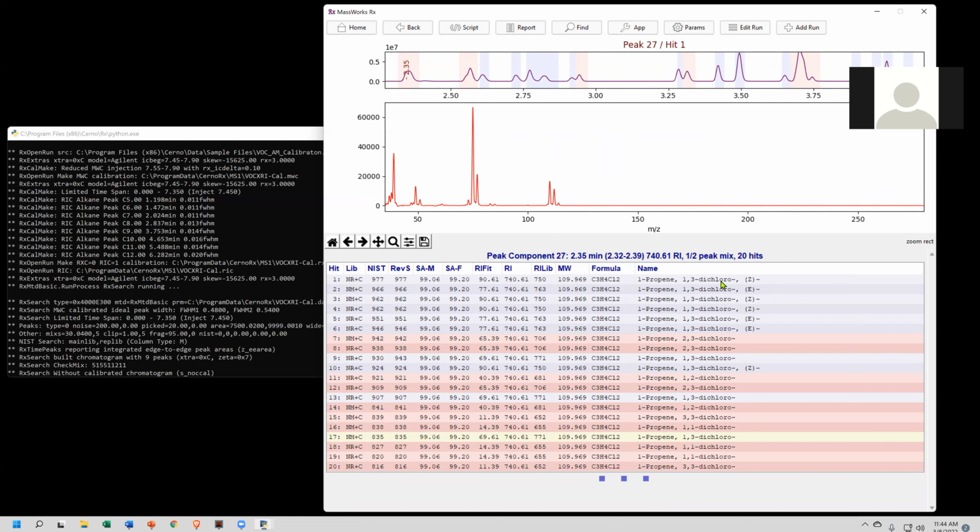And so it's actually valuable to look at those because they're slightly different measurements of the same compound. And since there's variation in the compounds, it's a good idea to look at the replica spectra. So you can see here that the next match is the E form, and it has a lower retention index fit. So I would say that's probably the right hit. Okay, this may not be as definitive as some of them, but that's actually a pretty good indicator, along with the search metrics I'm getting here.